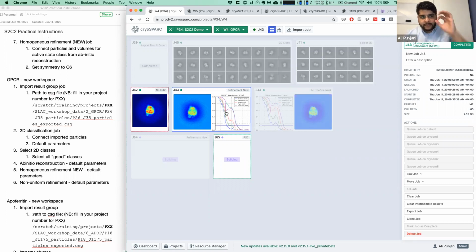And you also have the rotation of the micelle. And if the micelle itself has any variability, that might create more difficulty in alignment than the protein has signal that can drive the alignment. So it's a very difficult scenario, but I wouldn't say it's categorically impossible. You just have to be very, very lucky.